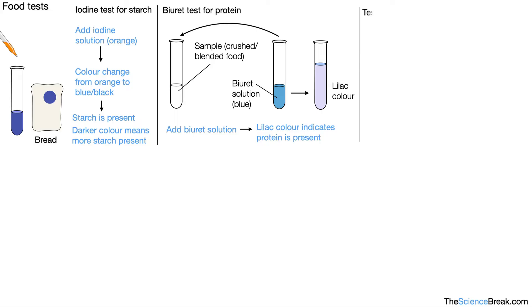The next one is our test for lipids. This one's slightly more involved. Here's our sample which has either been crushed or blended. What we would do is add a few drops of ethanol, and that's the start point of our test.